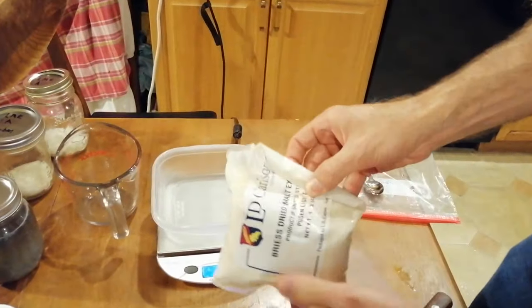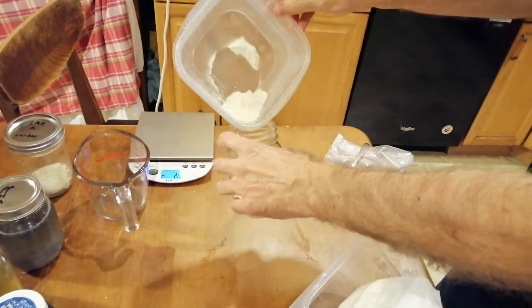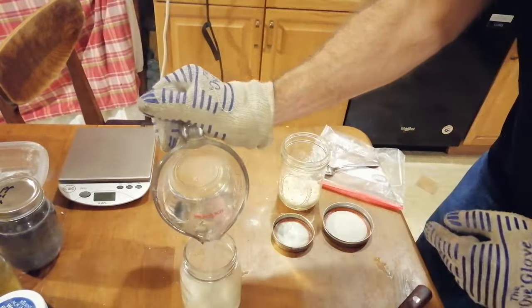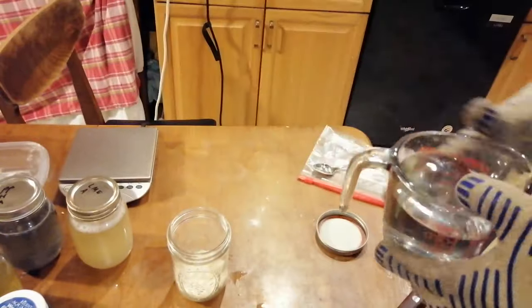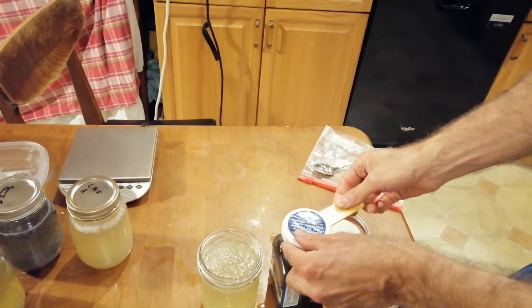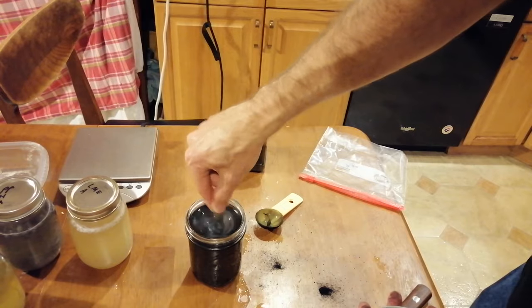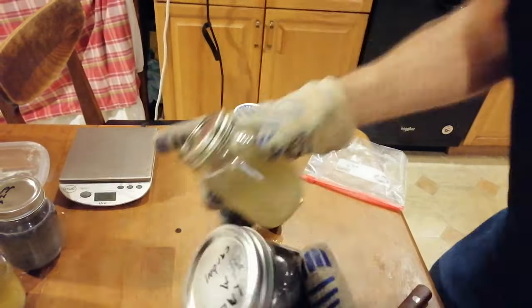Now for the recommended LME agar: weigh out eight grams of light malt extract, also known as LME, then pour that into one of the jars containing eight grams of agar powder. We'll repeat all of this for our black LME agar recipe. Then add 400 milliliters of hot water to each jar and shake to dissolve everything. For the black agar recipe we'll add two level tablespoons of the powdered carbon that we blended up earlier. Stir this up thoroughly with a spoon before putting the lid on, then give them all a good shake before we put them into the pressure cooker.